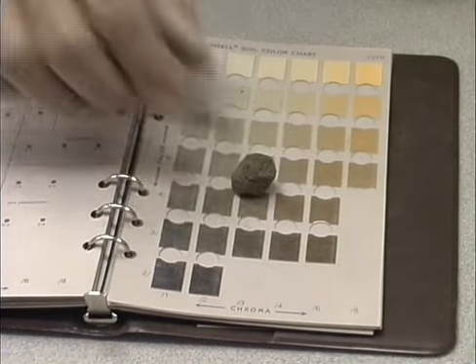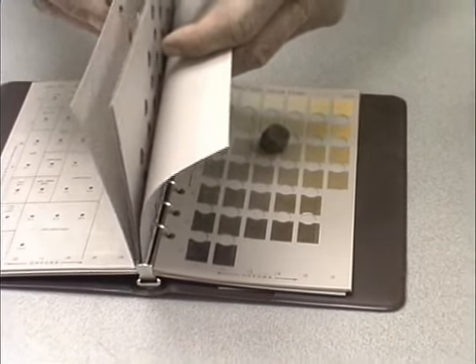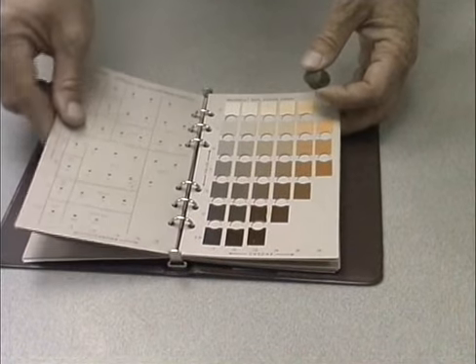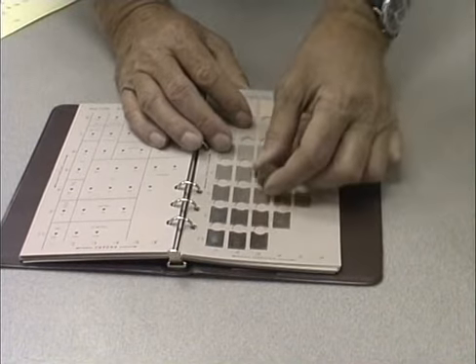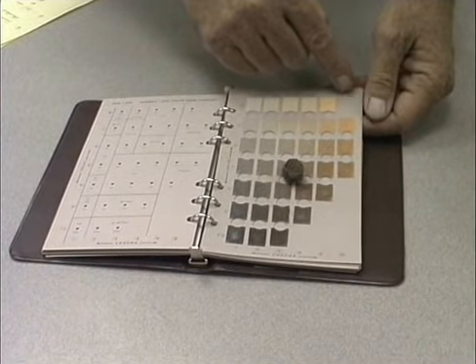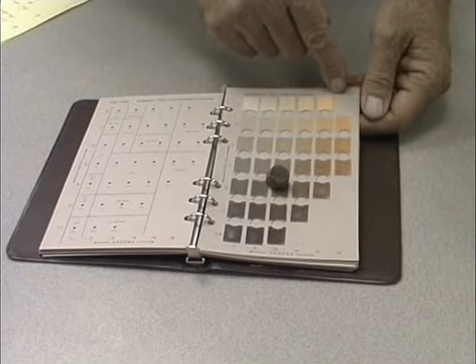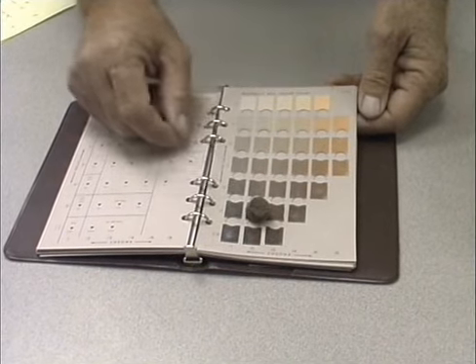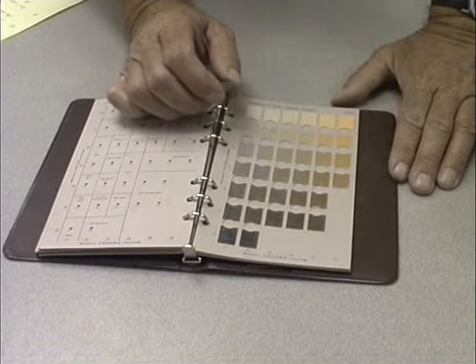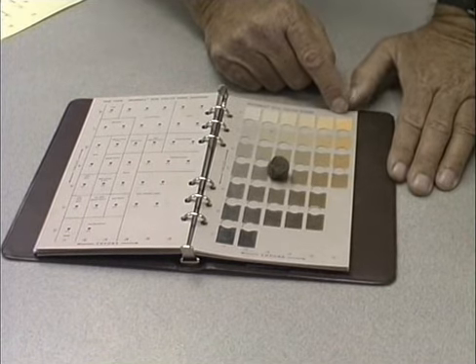Now, if I were to start on the wrong chart as an example, let's go back one chart previous to this one. If I go back to this chart and compare the ped that is in my hand with this particular chart, one of the things that comes out to me is that I'm probably in the wrong hue page, because this soil is a little bit darker in color than what I have on the 7.5YR chart. So I don't see anything that matches up very well. So the first thing to do is to identify the right color chart or hue chart to begin with. So for this one, I've determined that chart to be 10YR.